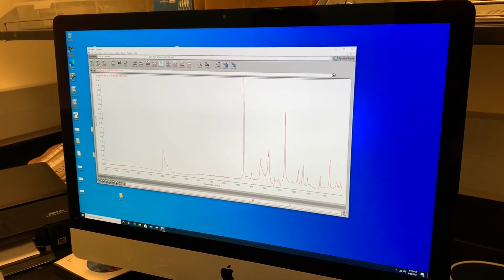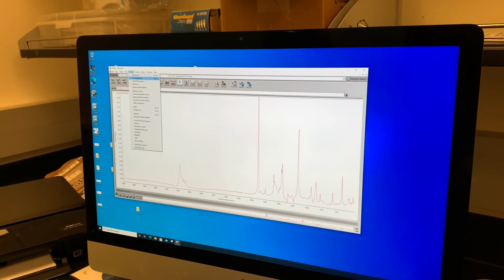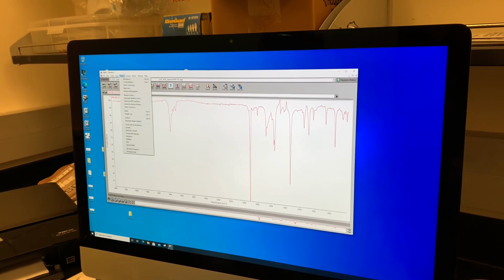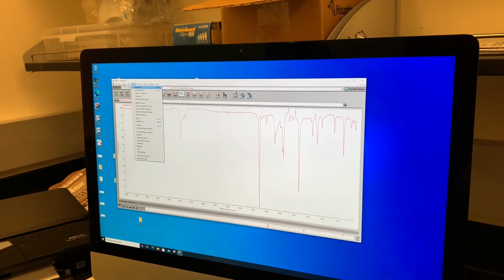And since we don't know exactly what this molecule is, that's part of this experiment, figuring out what the molecule is, the only way that we're going to be able to analyze the purity of this is just by taking a look at the appearance of the IR.